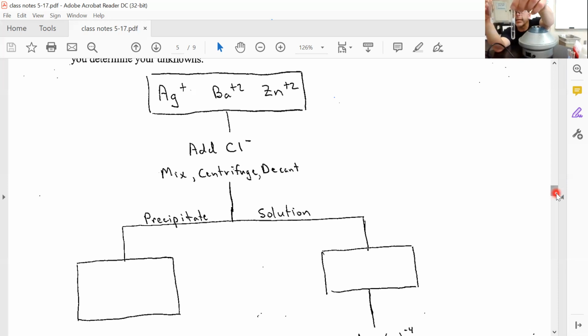So here's the blank test tube, and here's the test tube with the silver. It probably is silver combining with a chloride. I'm guessing it's silver chloride. Notice because it was angled, it all went kind of down to the bottom and to the side of the test tube. Now, what's cool about this is I'm assuming the silver chloride is gone. So that's actually going into this box right here.